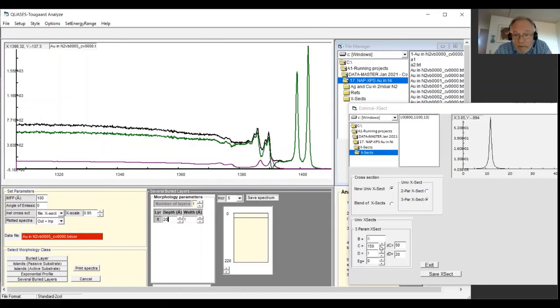We need to move this further out, and this is too much. 200, 150. Change this to 5 and vary this. So it's about here. See, it's too far out here. And at 70, it's close to the right position, but it's too wide here. It needs to be much smaller. So I put in 0.1, and we decrease the width of the peak. It seems to be even less than 0.1. So I put in now 0.005, and we decrease this.